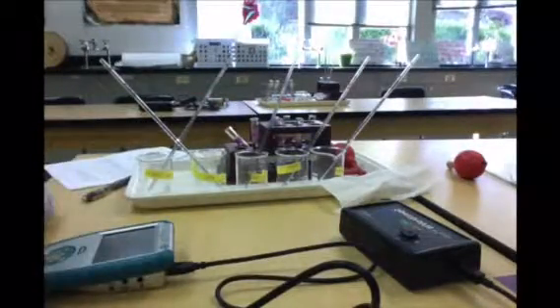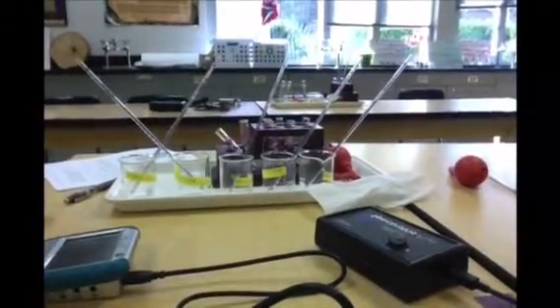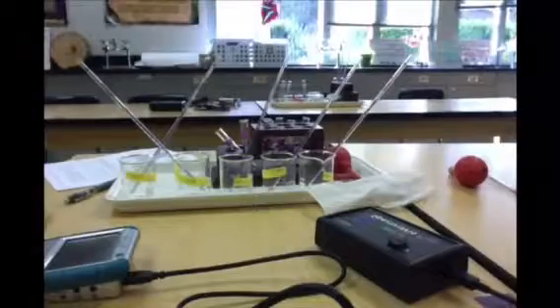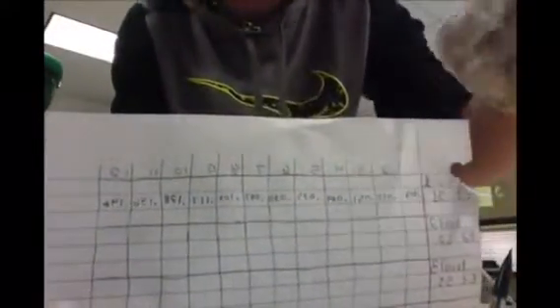And every 20 seconds, we're going to start with our absorbance. So every 20 seconds, we collected the absorbance at that time, and so we have it for a full 240 seconds, which is 12 intervals. So we're going to do that for 2 more trials.